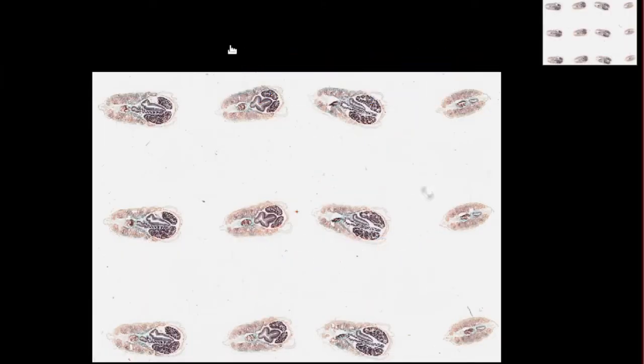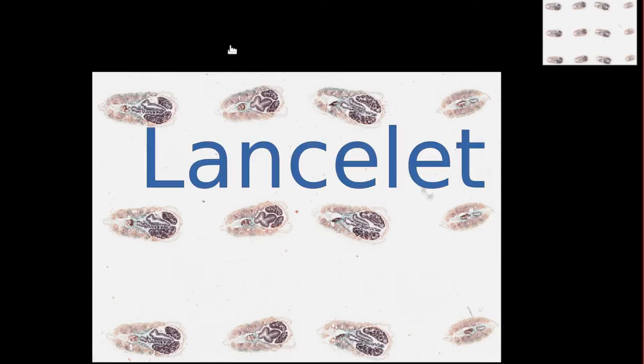Hello and welcome to Down the Scope. Today we're going to be looking at a slide showing serial transverse sections of a lancelet, also known as amphioxus or reasonably classified as a branchiostoma.